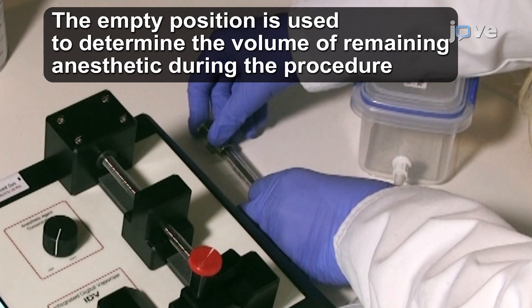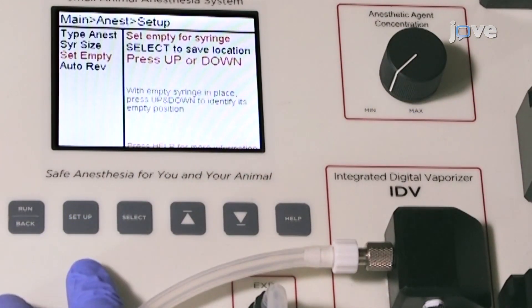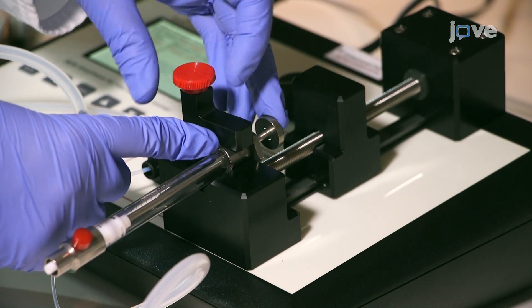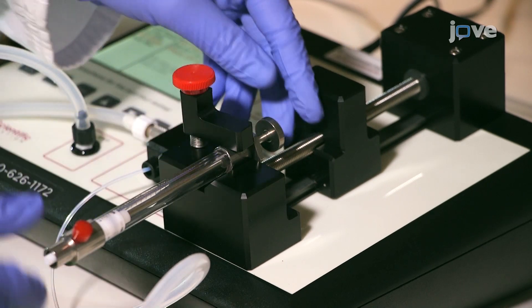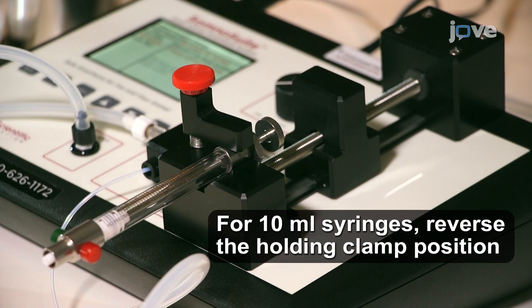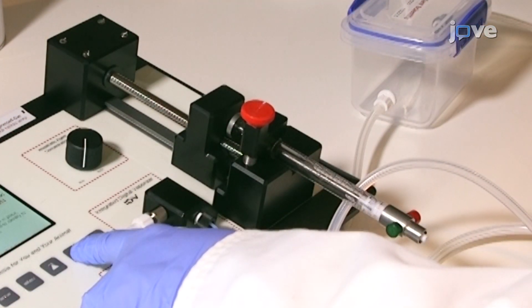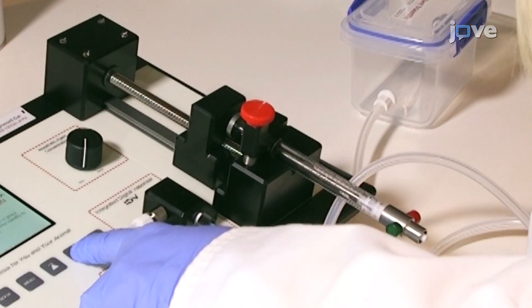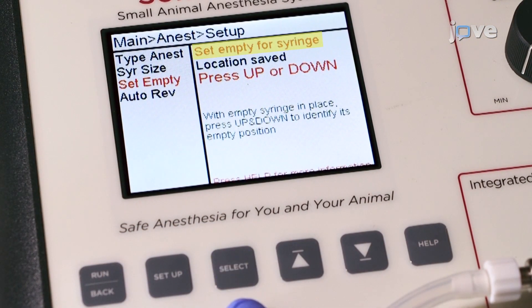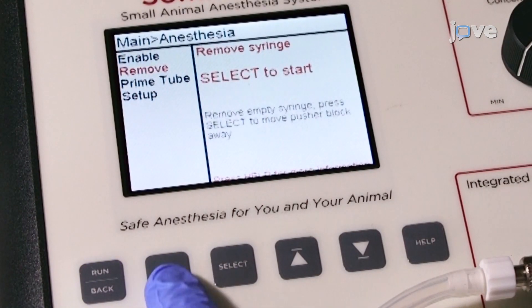After selecting the syringe size, set the empty position of the syringe. Now, secure the empty, fully depressed glass syringe in the syringe retention block. Place the syringe so that the holding clamp is seated on the metal collar of the syringe. Adjust the pusher block so that it makes light contact with the top of the syringe plunger. Save the empty position, then remove the syringe.